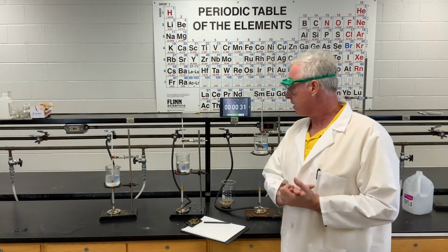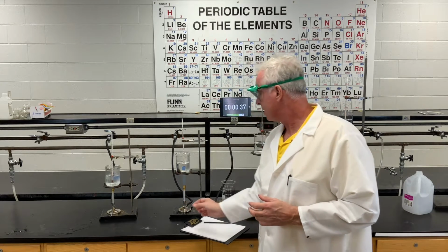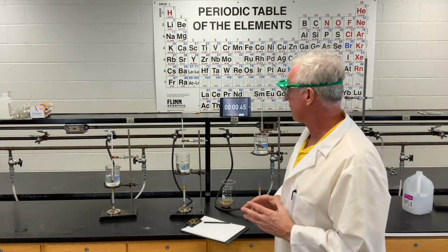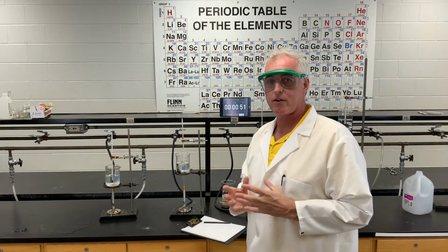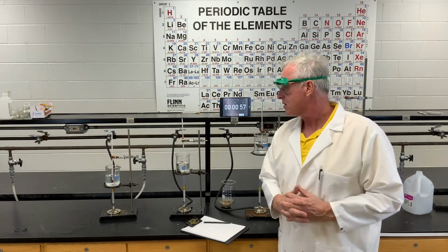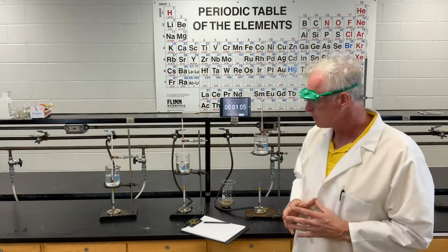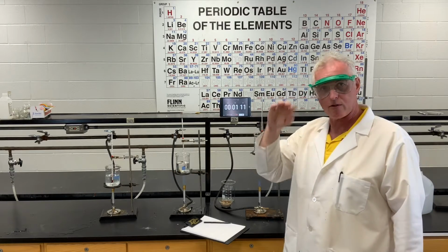While it's heating, I'll make a few comments about the pre-lab. Got some really interesting answers about independent and dependent variables. So I'm gonna post another video about independent and dependent variables, to make sure everyone understands. Some people put that one of the variables in the lab was the type of gas we use. Well, we're using the same type of gas across the board, so that would be a control, not a variable. That's something that's controlled. The independent variable is the thing that you manipulate in the experiment. So in this case, the independent variable is the heights, or the distance off of the burner, the 4 settings.